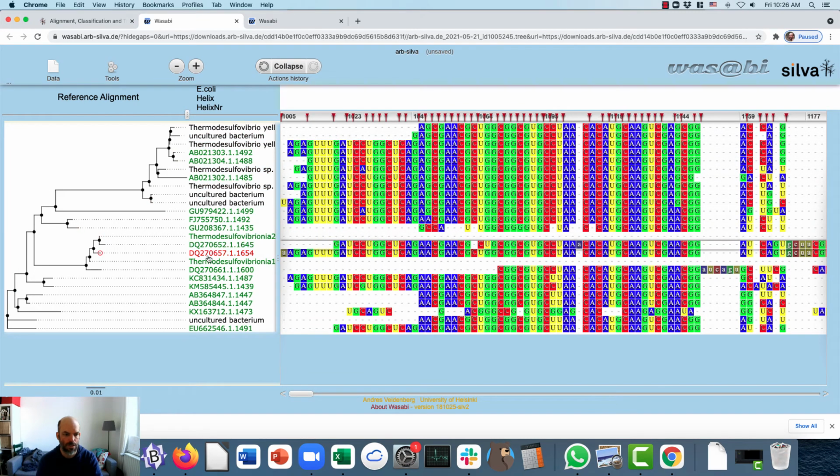Here are our Illumina sequences, still grouping with those old Lost City sequences, as well as the neighbors that we'd previously seen. And now we've got these additional sequences, those that we manually added to our cart, as well as some additional neighbors that it found when we chose add to neighbors tree. Okay, so we're sort of filling this out.